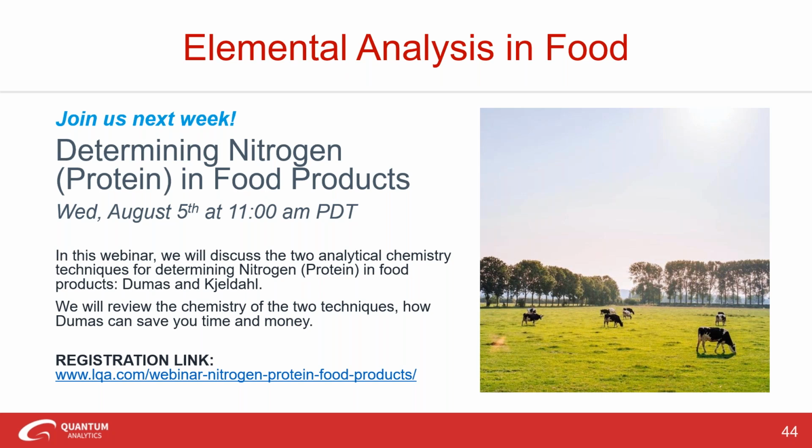Fantastic. Yeah, sounds like a good application for that. Our next question is, can XRF detect nitrogen in plant matter? Oof. Yeah, unfortunately, that is one that XRF is not a good analyzer for. This would be better for an instrument like we're going to talk about next week, using a combustion method to analyze nitrogen content. It really is able to do low levels of nitrogen all the way up to high percent levels, and really is kind of the standard in the industry.